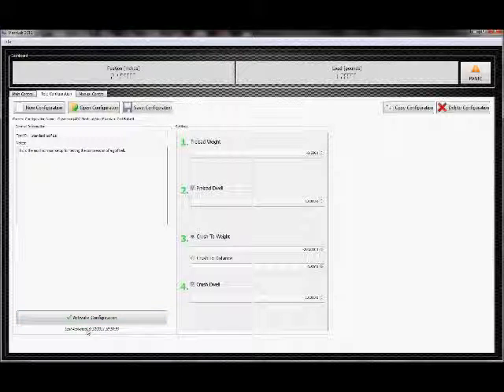We tell you the time you activated just so you can keep track whether or not you've made a change and reactivated. Save configuration allows you to save changes. You can make edits to the test configuration and activate them.